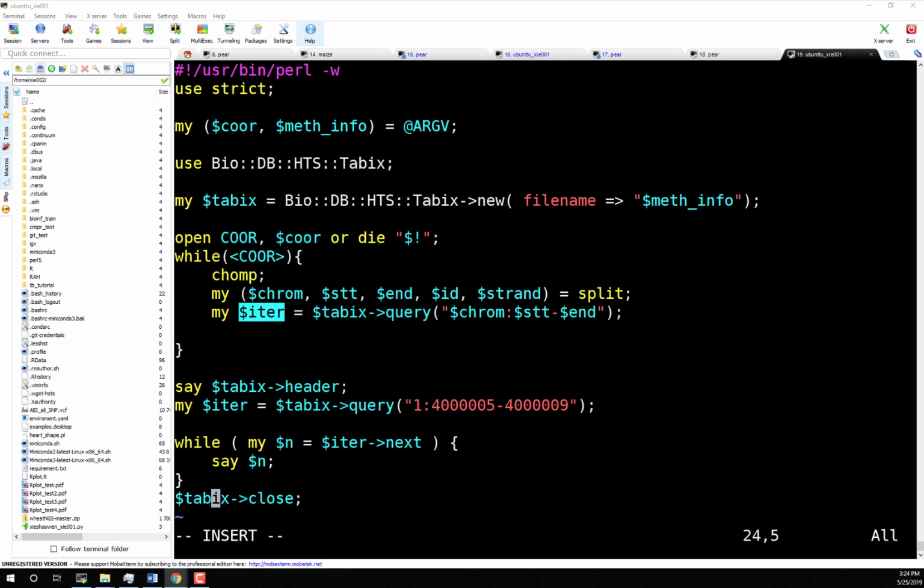If we want to get the bins, we first need to get the bin size for each gene. So for each of the loops, we need to get the bin size. Let's say we already set the bin number, which we can provide from the parameter.